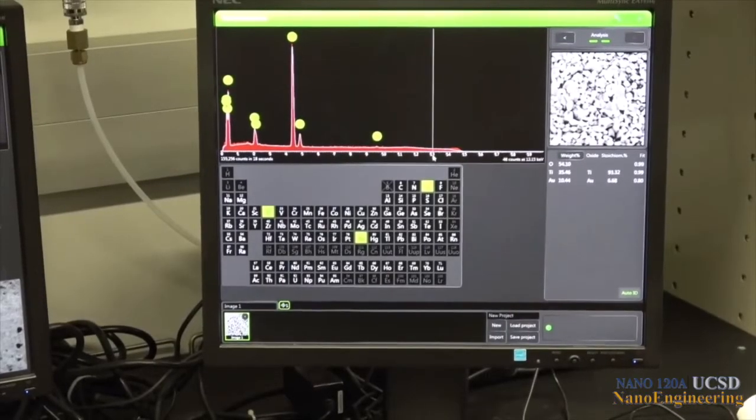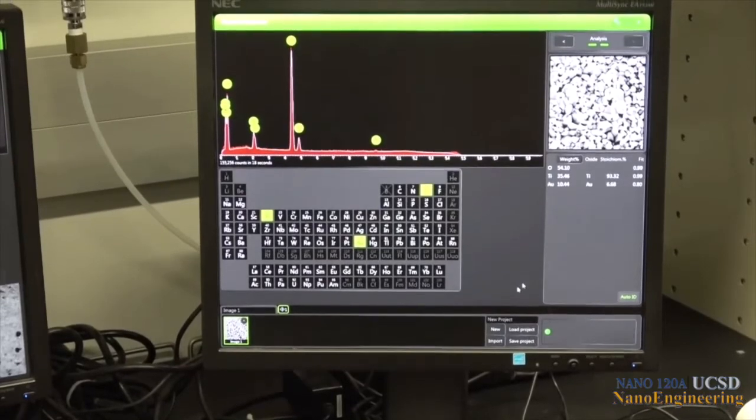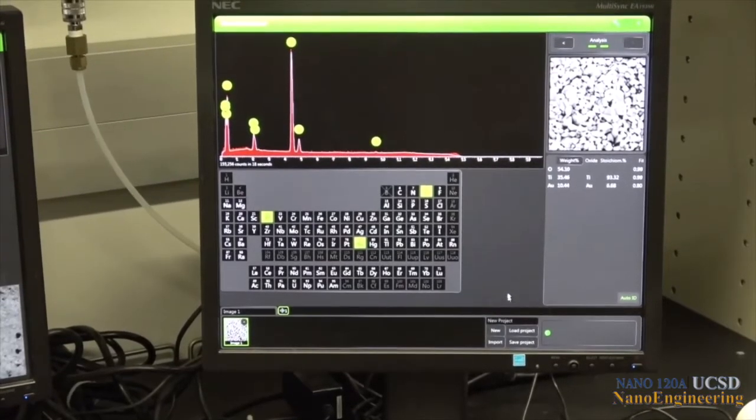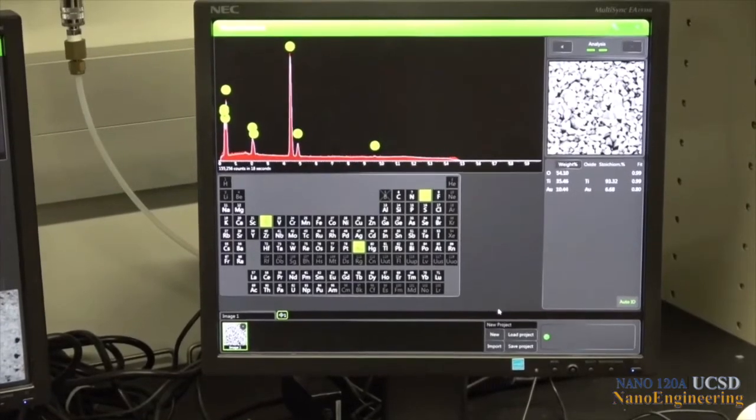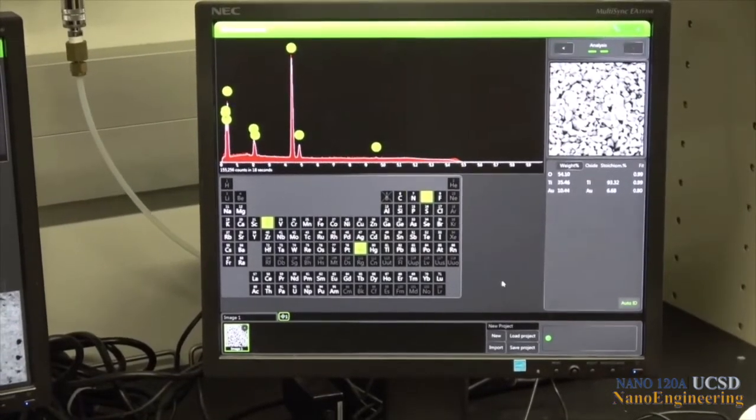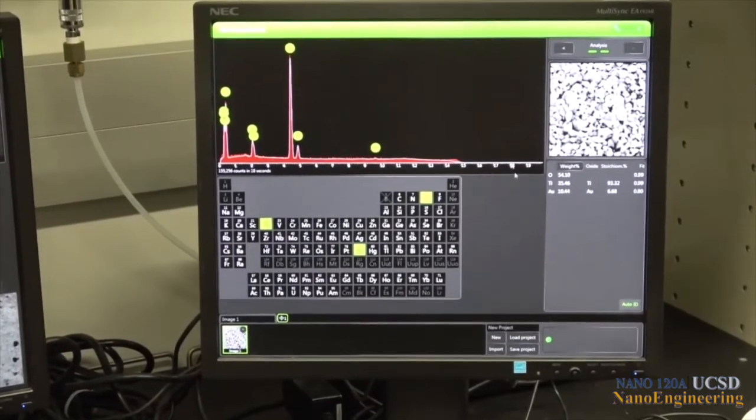In our demonstration of the X-ray EDS system we focused on the qualitative analysis of a fractured surface sample. That is, we were able to identify what elements are present in our sample. However, a fracture surface with its topographic features is not the best candidate sample for accurate quantitative X-ray analysis. That is, for identifying how much of each element is present.